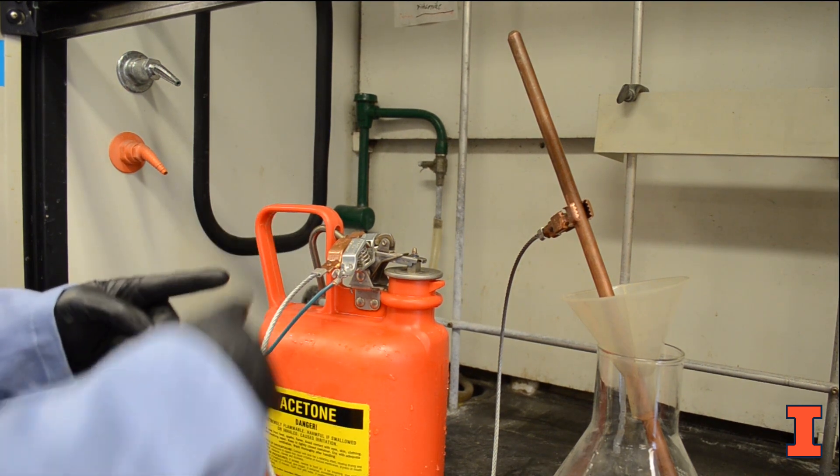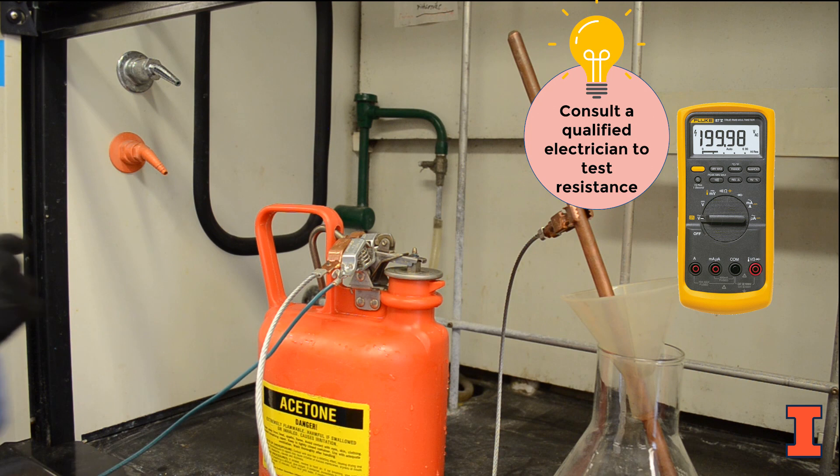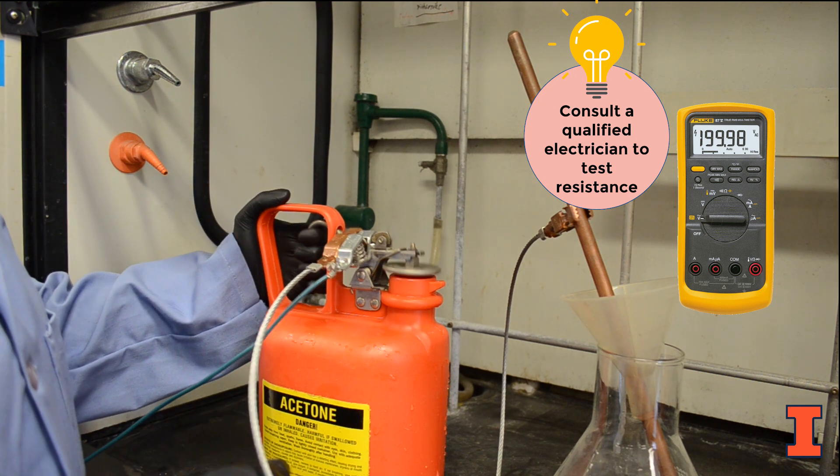When your containers have been securely bonded and grounded, you may test the resistance to ensure that you have achieved proper grounding. A resistance of one meg ohm or less is acceptable according to the National Fire Protection Association.